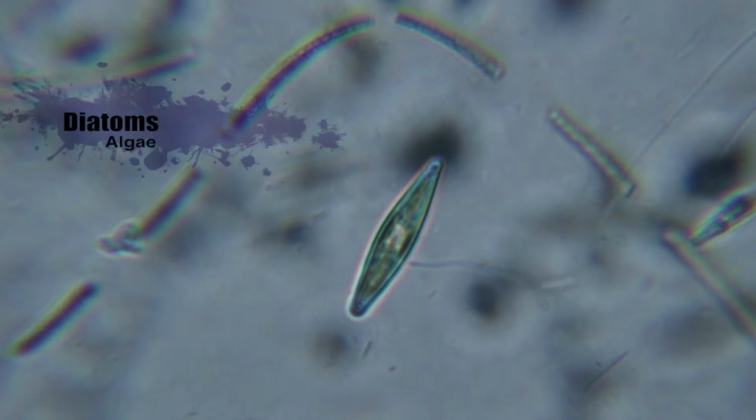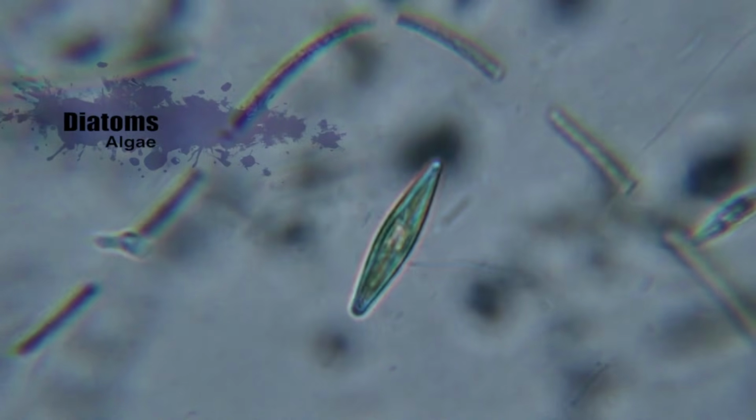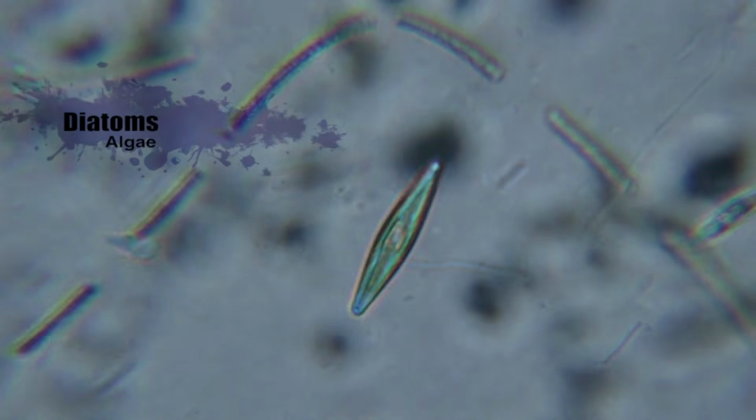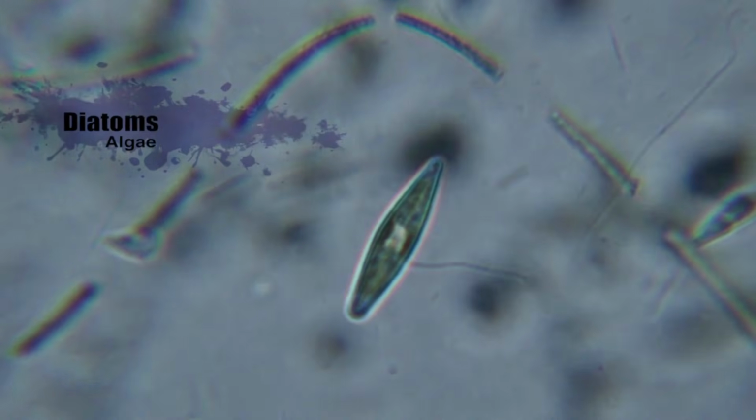This is a diatom. It is a single-celled algae. Relatives of these in the oceans are responsible for an estimated 45% of all organic production.